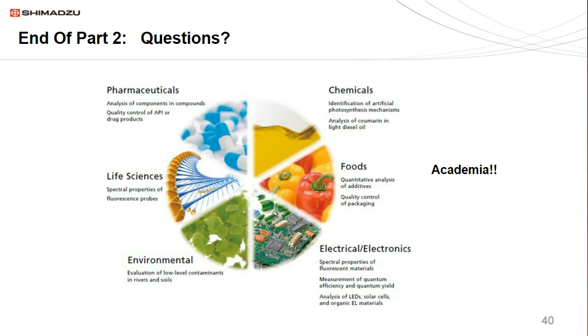So the reason we use the full width at half maximum is that it is a good way of getting just the center core of the peak. It's better than a peak height, and it is less subject to problems from the peak tailing out into the red. So it's just a slightly different form of area that is less subject to artifacts from sample to sample.